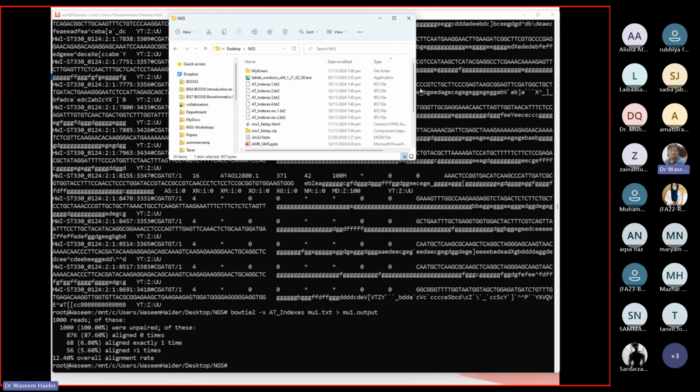Some of the genes are expressed on the reverse strand also, but I guess their numbers are fewer. So when it tries to map a read, the read is in the forward direction, and the transcripts are also written in the forward direction in the database, on NCBI or wherever you get them. So what it does first is try to align them as such, both in forward directions.